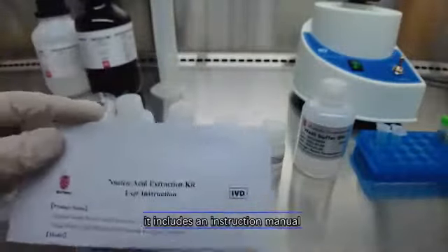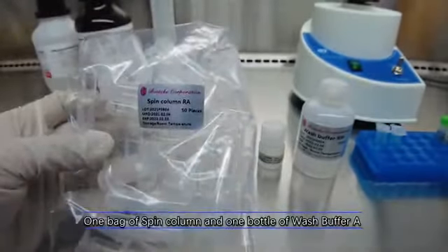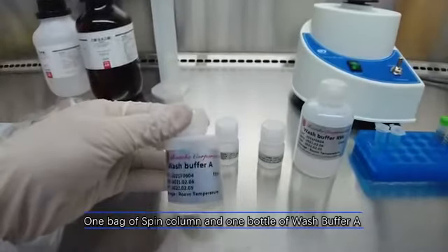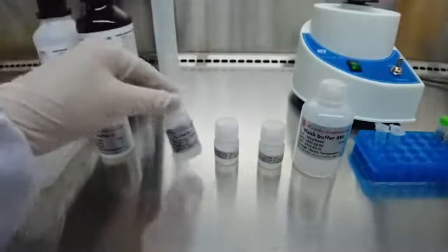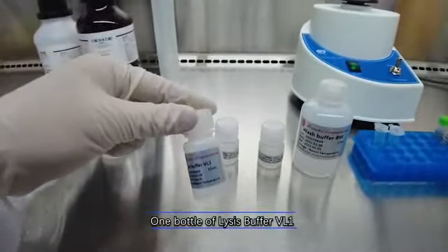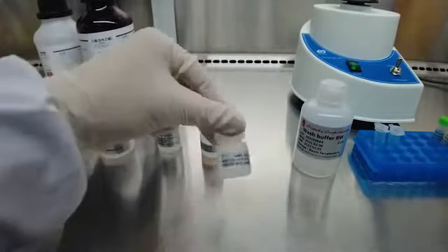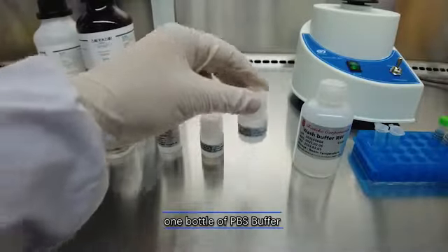It includes an instruction manual, bag of SPING Column, and bottles of Wash Buffer A, Lysis Buffer VL1, Elution Buffer, and PBS Buffer.